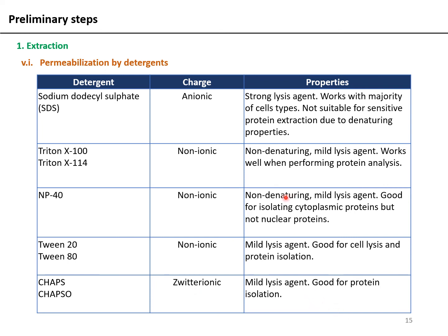So what particular detergent you will be using for your cell lysis will depend on the system. It will depend on the protein that you're purifying, and it will obviously require some optimization before you can finally zoom in on a specific detergent and a specific amount of detergent that needs to be added. However, do keep in mind that if your aim is to purify membrane proteins, then none of these detergents can be used for that particular purpose. Very specific detergents are available for the purification of membrane proteins in micelles.